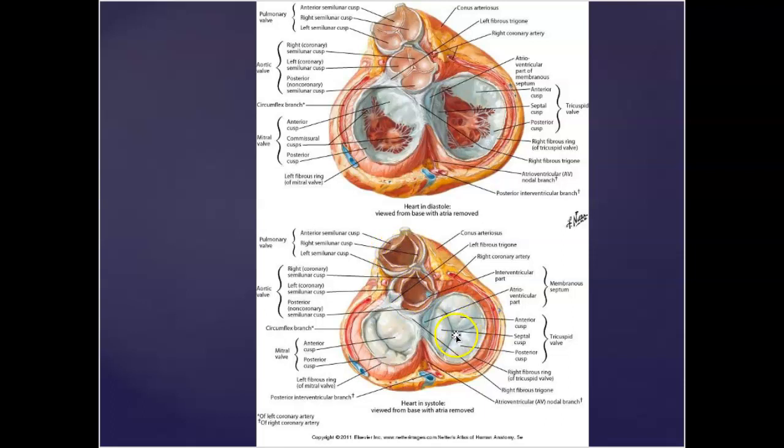And then those chordae tendineae, you can see how there's like these balloons there. It's like that blood is forcing back, all wanting to go back into that right atria and left atria, but those chordae tendineae are holding those valves shut, not letting blood back out from where it came from, but rather continuing its circuitry through the aorta and through the pulmonary valve. Kind of a cool shot there.